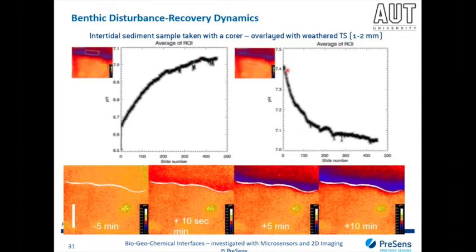Whereas in the bulky phase, you see an initially higher pH value of around 7.4, which then slightly drops due to some proton diffusion from the sediment into the deposited sediment, but also due to some reworking processes taking place. So you can record your data set, and then you can choose your region of interest, or you can also choose multiple regions of interest and compare what's happening in your sample.